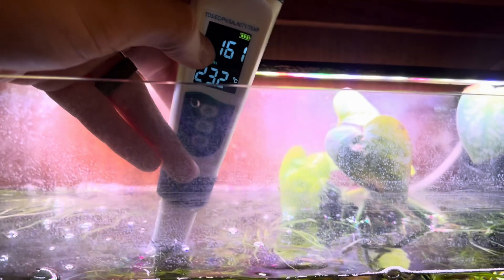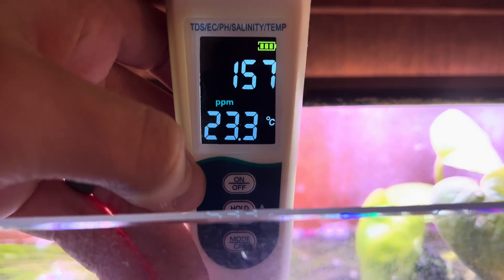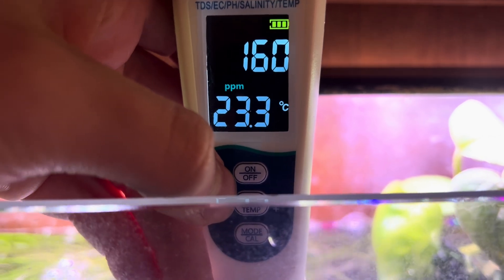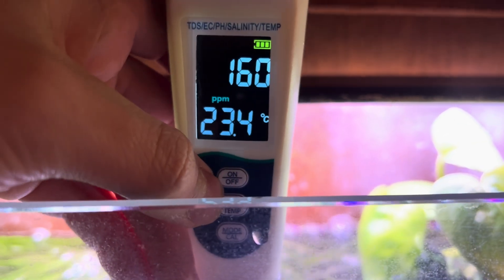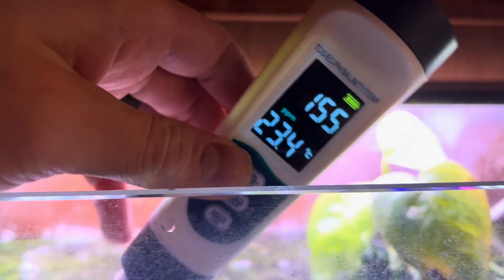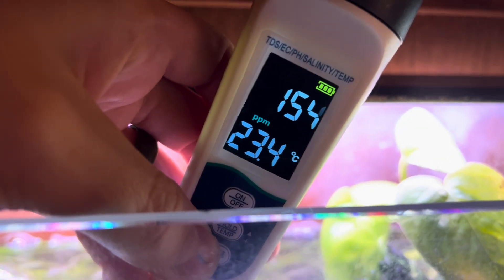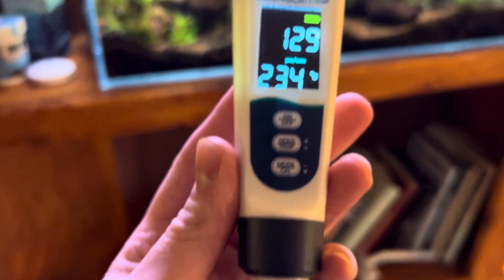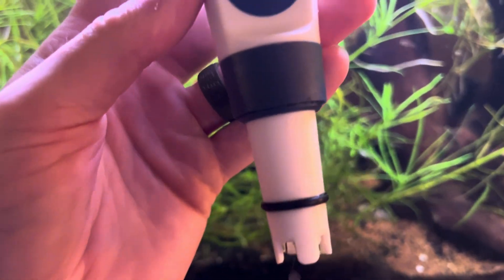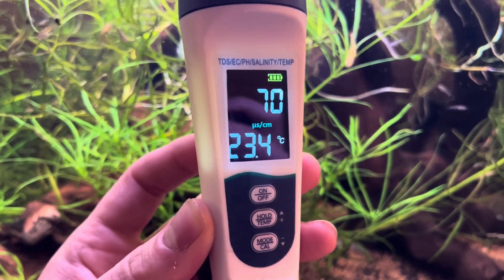You might also want to use this, for example, if you're growing a garden — like a hydroponic garden where you're trying to grow lettuce, fruits, or vegetables. It's just going to be really handy to have on hand and will help you measure most of what you need. Just make sure you clean the tip really well whenever you're done with it, store it dry with the cap on, and it will stay accurate.